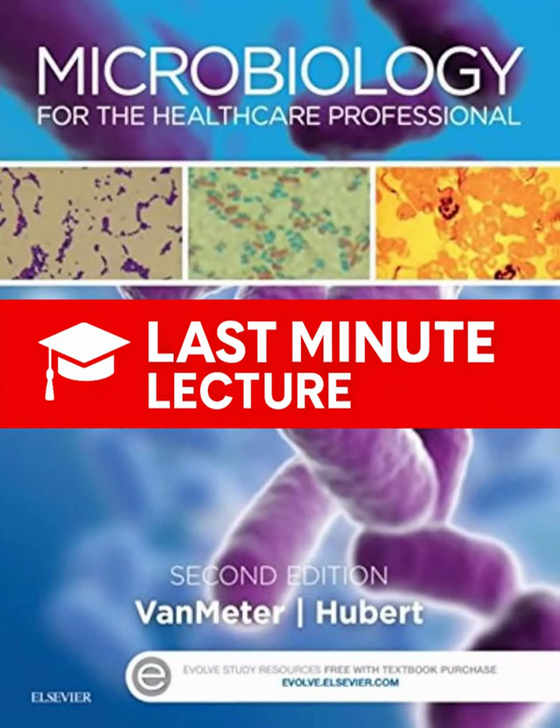Which leads us perfectly into the third, isolation, making sure you're looking at just one type of microbe, a pure culture. Yes, absolutely critical. If you have a mix, you can't reliably test or identify anything. Isolation is all about separating individual bacterial cells on the agar surface so that each one grows up into its own little colony. And each colony ideally came from just one single cell, so it's genetically pure. How do you do that separation?